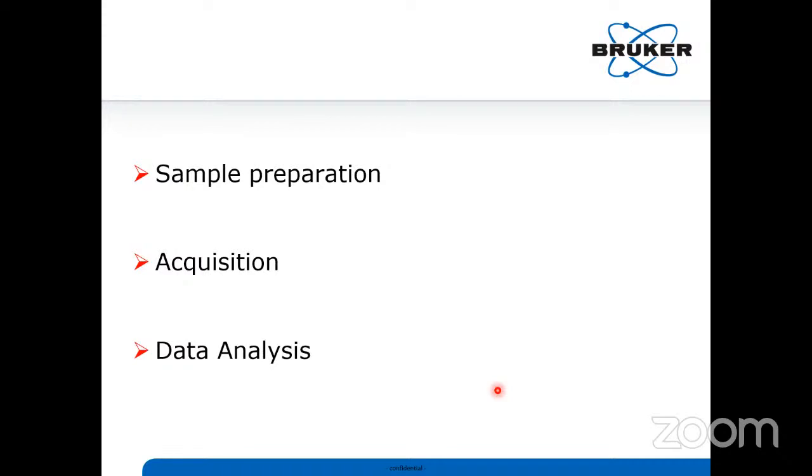If it is a protein level, you will have only a single compound. If it is a protein level in your sample, you will have a maximum of 1 or 2 proteins. In that case, filtering is very easy for you when you are doing data analysis. At the same time, if you digest that particular protein into peptides, you will have at least 150, 200 peptides. You should not miss any low intense peptide peaks. At the same time, you should not encourage any noise peaks. So when you are processing your data, you should know the exact threshold limitations.